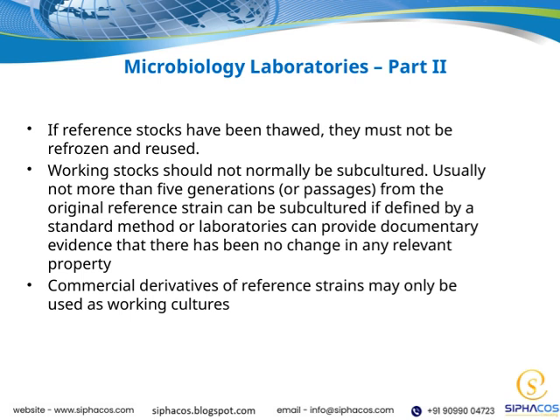It's also crucial to note that commercial derivatives of reference strains are only to be used as working cultures. They should not replace the original reference strains, but rather serve as secondary options. All of these points tie into the broader theme of maintaining the quality and consistency of microbial reference materials in microbiology laboratories. Proper handling and documentation are vital to ensuring reliable and reproducible results across different testing procedures.